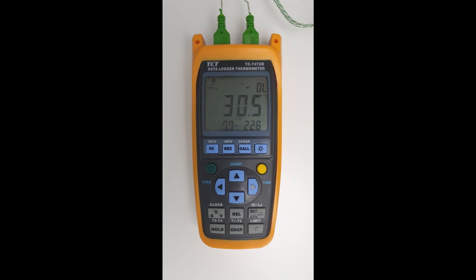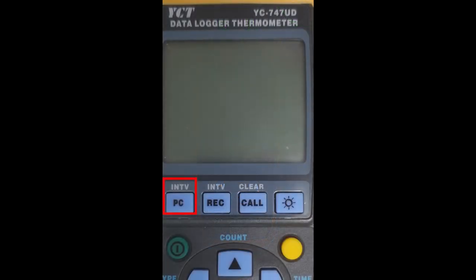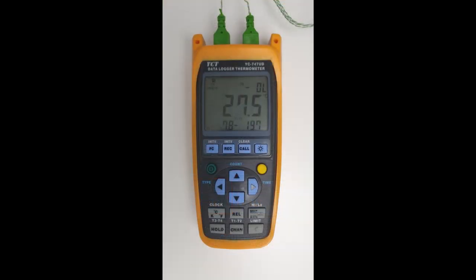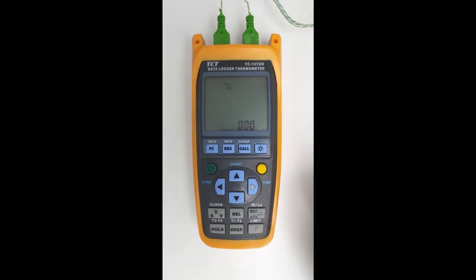The final feature I want to show is the recording interval. There are two kinds of recording intervals: the PC recording interval, which is when you connect the logger to the PC for live readings, and the recording interval which is in data logging mode. We're going to be more concerned about the data logging mode. At the moment it's set to once every second, but we can set it in one second intervals up to 59 minutes and 59 seconds — so nearly an hour.